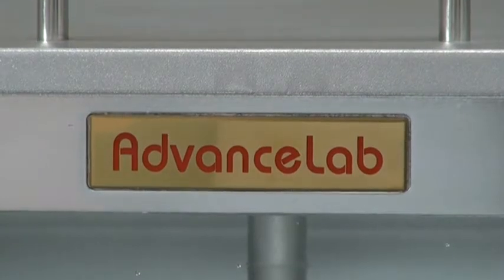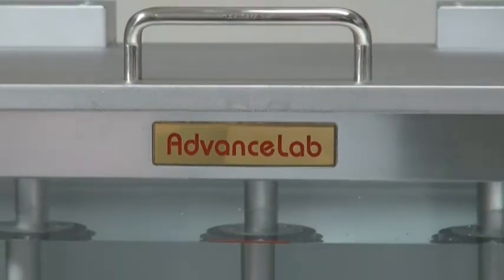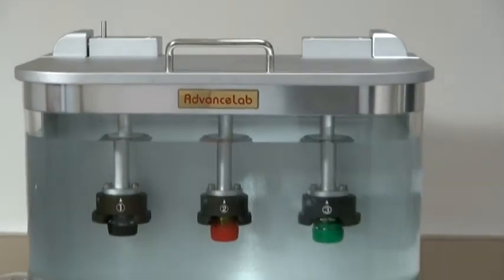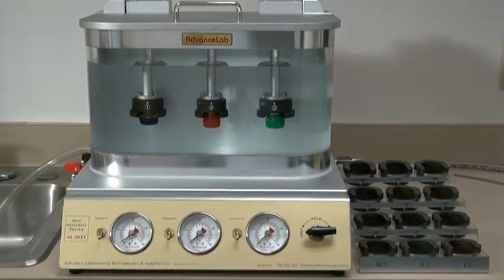The Advanced Lab Seal Integrity Tester is designed with unique and attractive features. The fixture design enables the operator to test sealing on three bottles in one single pass, with individual on-off controls for all three testing stations.